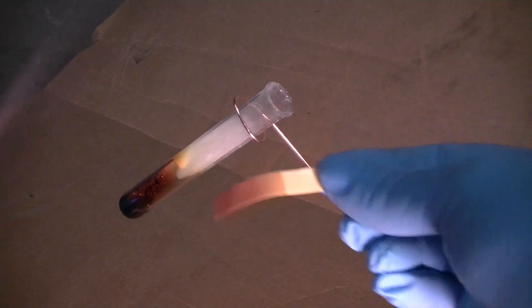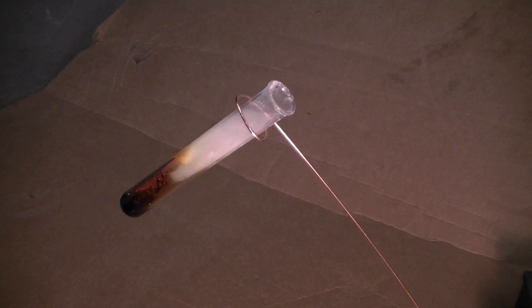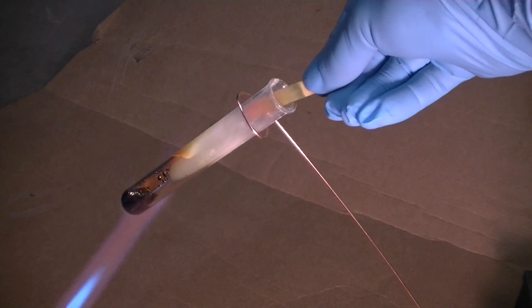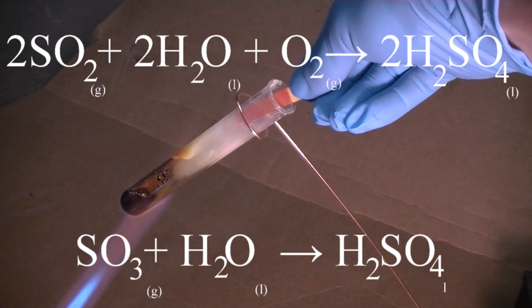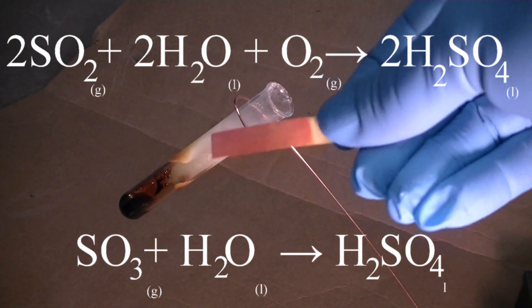As the produced sulfur dioxide and sulfur trioxide gas flows over the moist litmus paper, there is a reaction with the water in the litmus paper forming an acid. The acid which is formed is sulfuric acid, turning the litmus paper red.